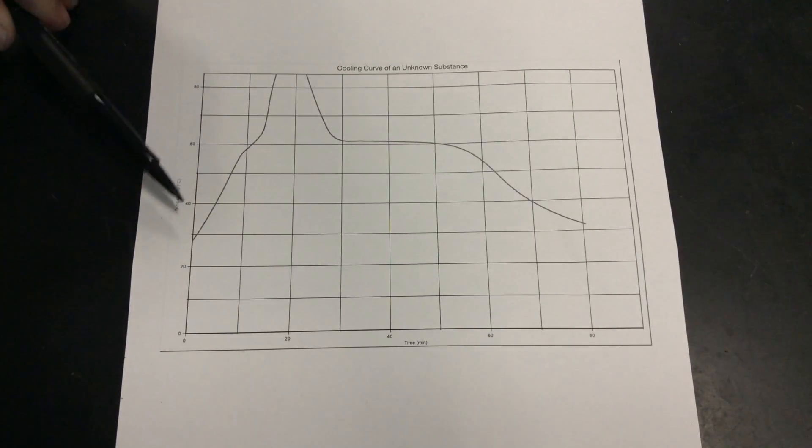But we can still see this is probably going to be the solid, if you remember the video, the phase change and now a liquid. And then somehow, and we don't really need this part of the graph, we took the liquid out of the hot water bath and it cooled.